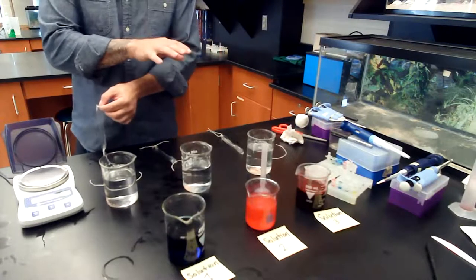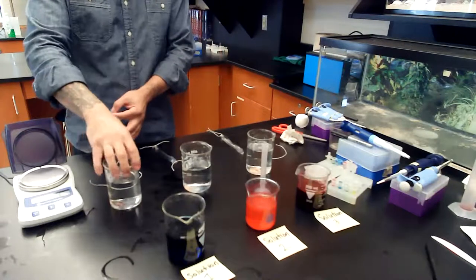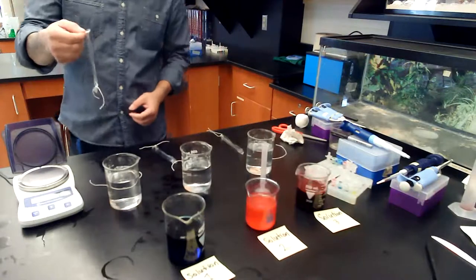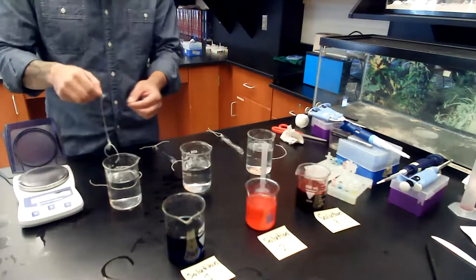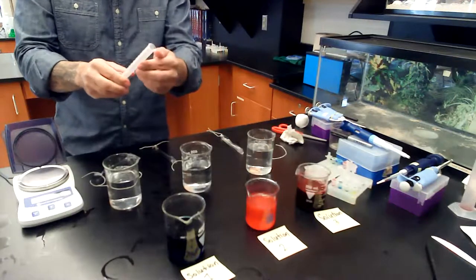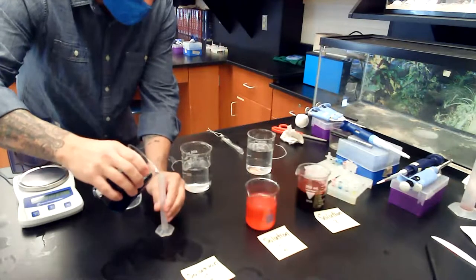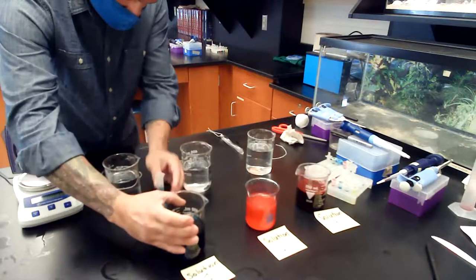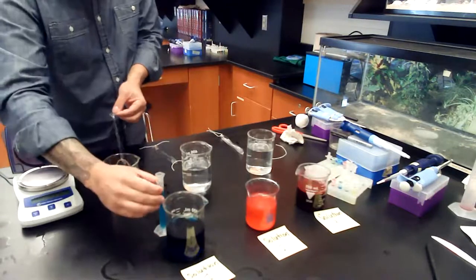Okay. So what we have here are three different solutions, right? And we have three beakers of distilled water. We have this dialysis tubing, which is in your lab. It'll tell you what that dialysis tubing actually does. In each one of these dialysis tubing, we made tubes that we can hold this solution in.